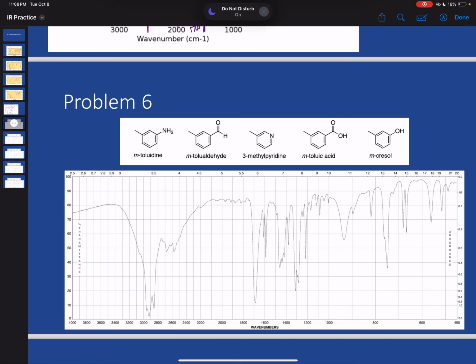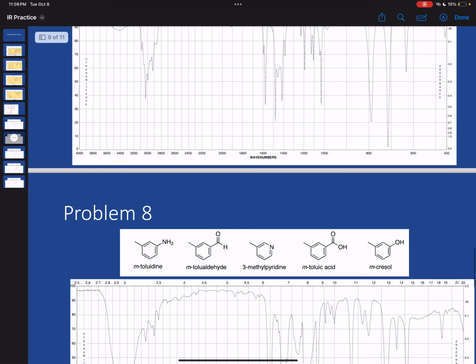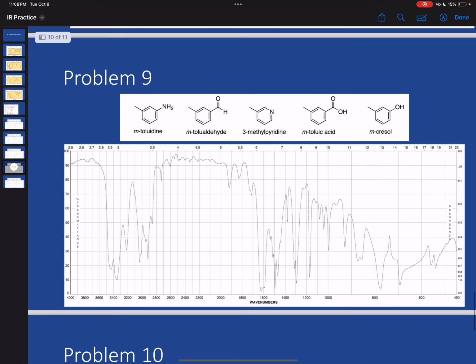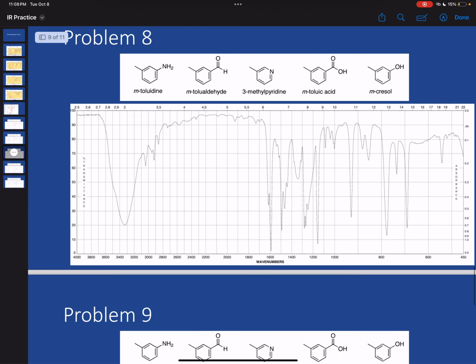This is the last IR video I have. So this one's going to be pretty long because what we're going to do is, we were given 5 structures, and then I'm going to go through and try to determine which structure matches which IR and show you my thought process. It's very similar to something we gave you guys in recitation.